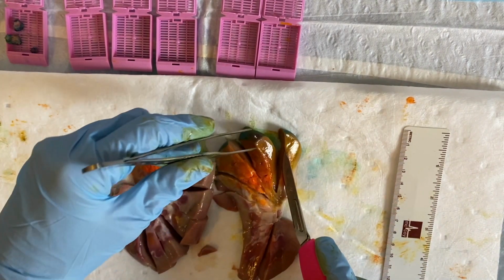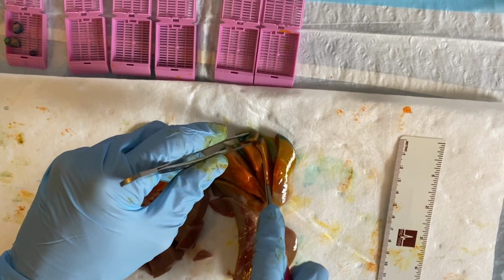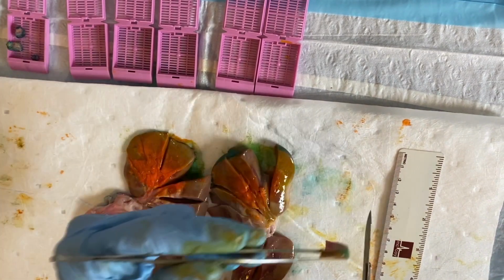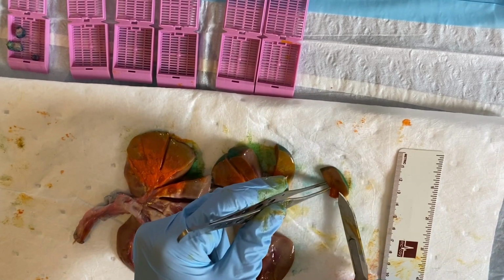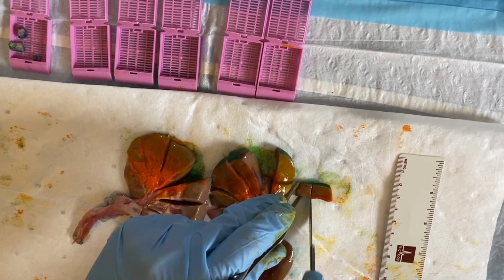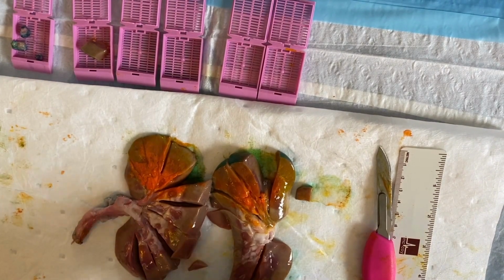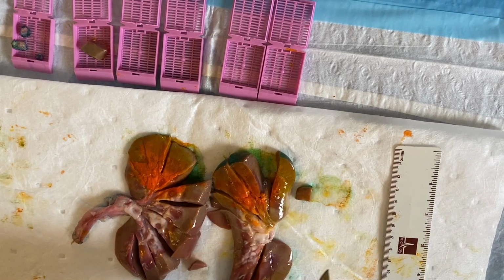As I mentioned here, I was stating that this was my closest tumor to kidney capsule section. So as you can see here, there's ink, there's my lesion, and there's the outer capsule. So that's one important section. I'll make sure to put that in my cassette, and I would of course trim it as it's a little thick.